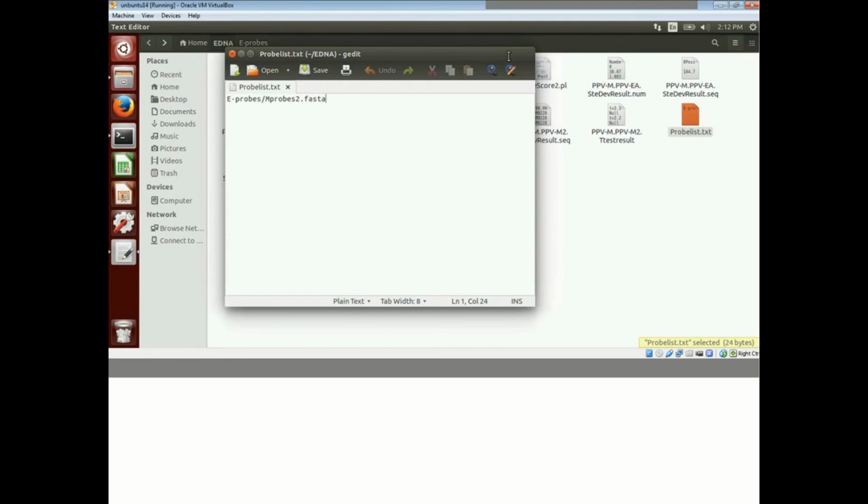All right, so I think we're at a point where some people have it working, some people don't, but we're still going to move ahead and show you a couple more examples. We're not going to ask you to try and keep up on the command line, but you got an idea for where the stuff comes in, how it works, and how it fits together. We're going to try and send out a typed up version of this protocol so you can actually have a hard copy in front of you. There is a Word document that goes with this, but it's a little bit more complex than it needs to be.